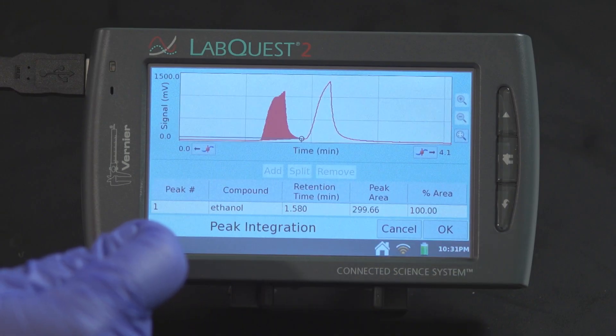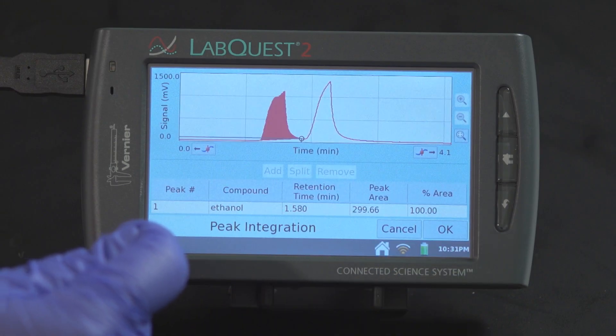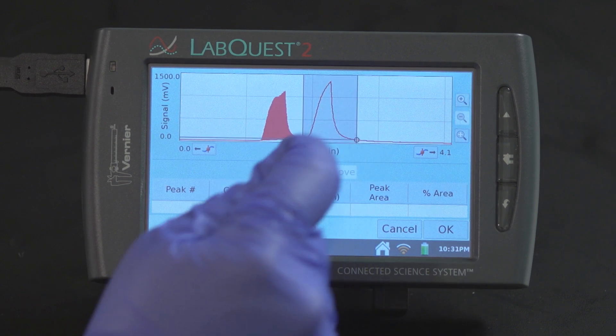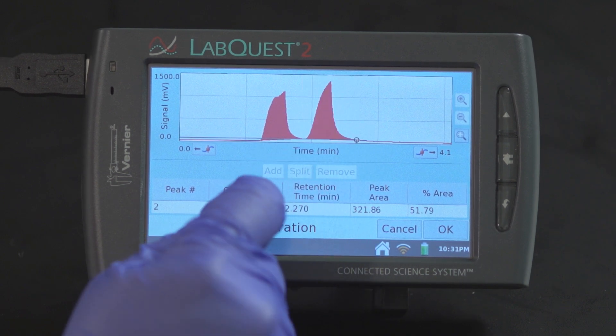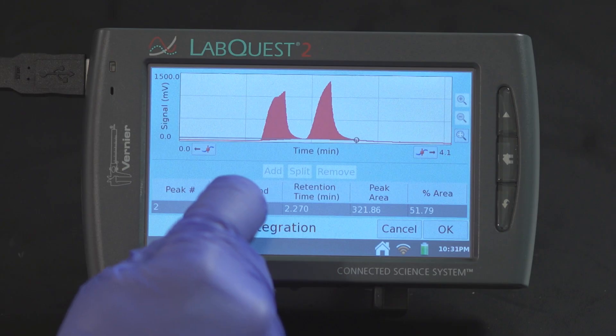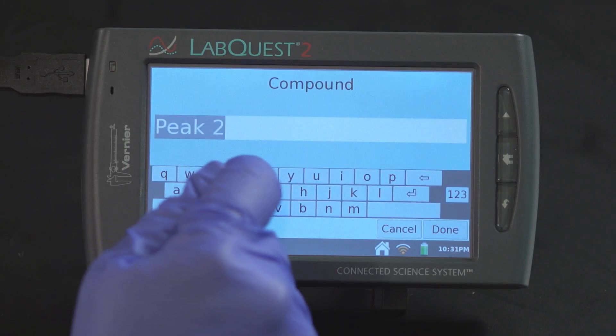Repeat these steps until all peaks have been analyzed. For the second peak, type in 2-butanone.